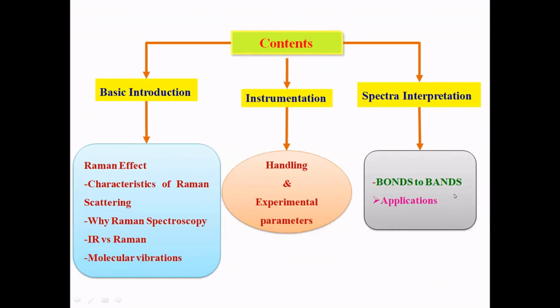Talking the content in three different perspectives, starting from the basic introduction of Raman spectroscopy, which covers the Raman effect, characteristics of Raman bands or scattering process, and why Raman spectroscopy is important, and the key difference between IR, that is infrared spectroscopy, and Raman spectroscopy. And I'll be touching upon some of the basic concepts of molecular vibrations.